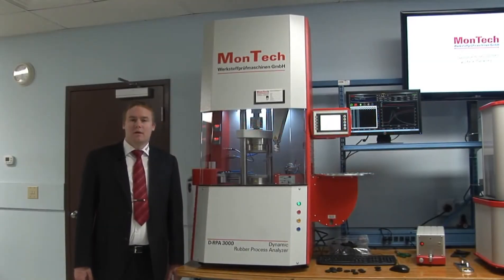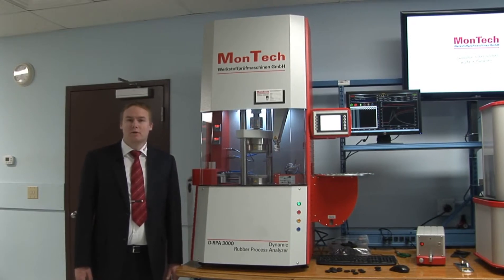Hello, my name is Ralph from MonTech and today I would like to introduce the DRPA 3000 to you.